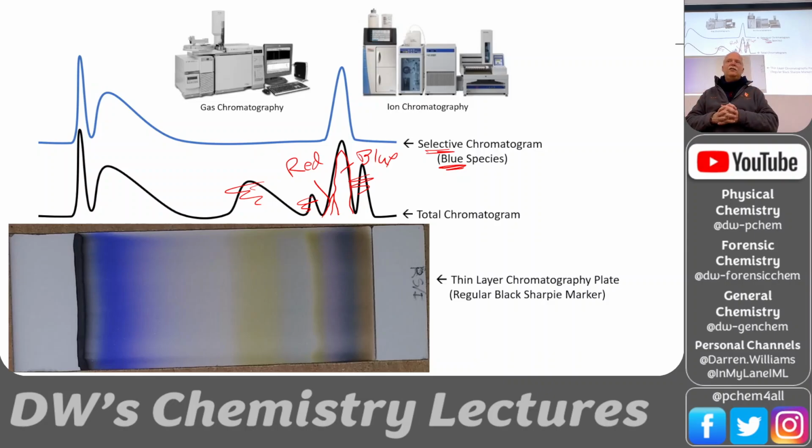The other detectors, like just thermal conductivity, it's just got a little hot wire in there, and it's measuring the current through the wire. And if you have helium or hydrogen going past the wire, it has a certain conductivity.